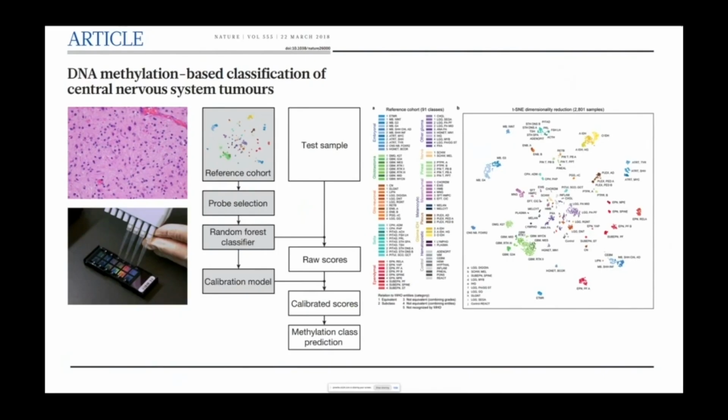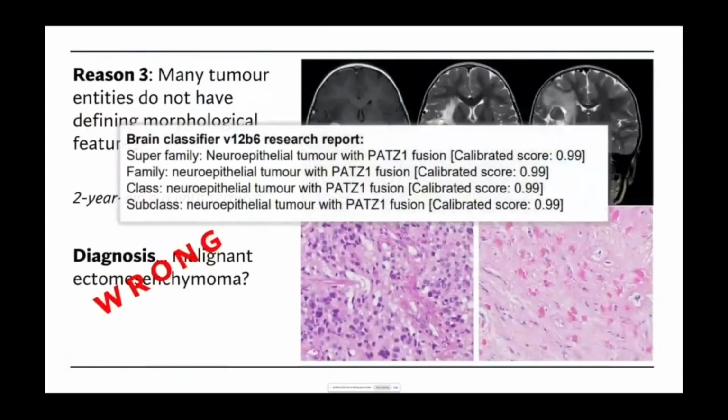And just thinking back to that previous sample that we looked at, when analysed based on the clinical data alone, that diagnosis was incorrect. This is a different tumour type based on the methylation, and it actually has a characteristic fusion that subsequently could be identified. So there's plenty of reasons why it's challenging to classify distinct tumour types.